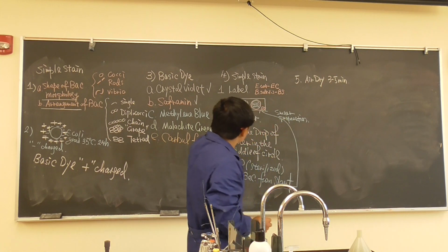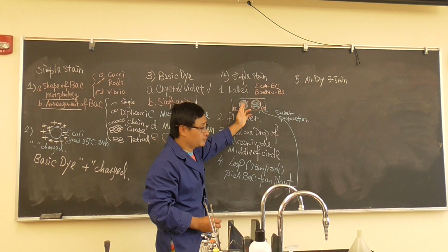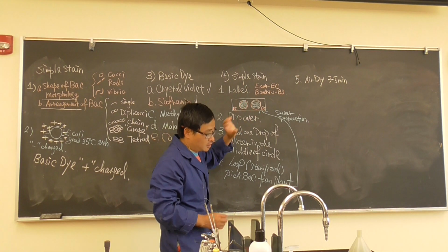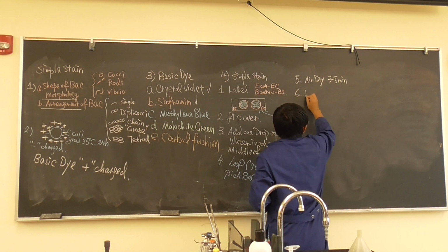Okay, and the key is that there should be a drop of water right in the middle, not a bunch of water there. It's a tiny amount of water. So air dry for 3 to 5 minutes. Then we're going to have to do heat fixing.